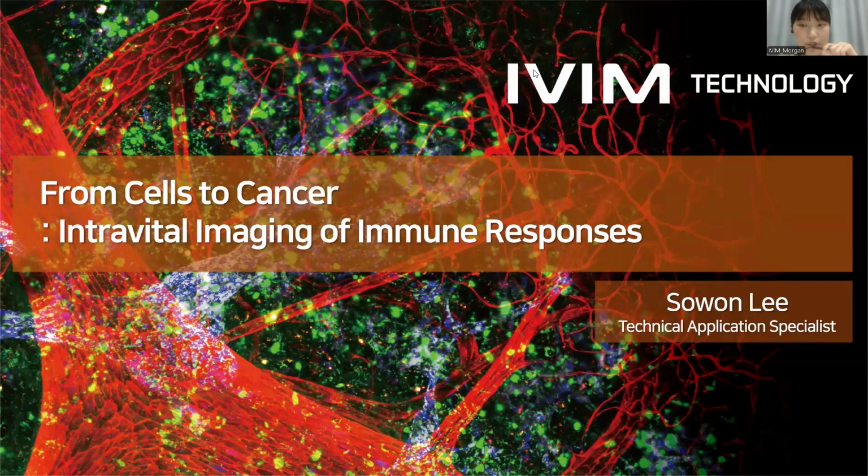In today's session, we'll be discussing from cells to cancer, intravital imaging of immune responses. We will explore how intravital microscopy captures real-time immune cell dynamics in living organisms, highlights research cases on tumor infiltrating lymphocytes, and show how this technology adds values to the in vivo evaluation of immunotherapies.